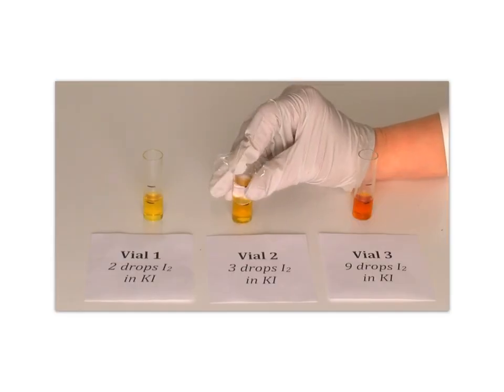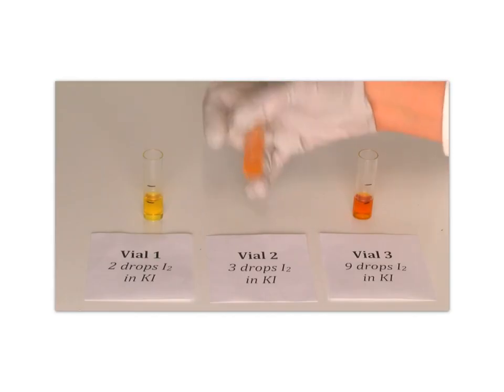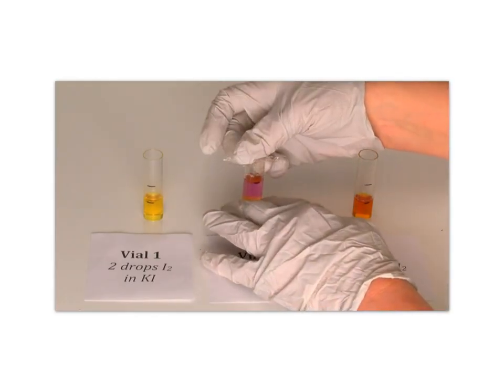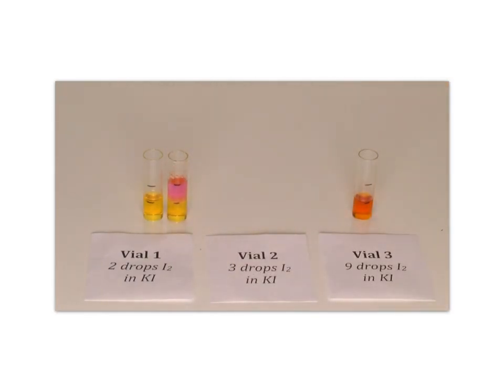Vial 2 is shaken to mix the hexane and aqueous layer. When the layers reform, the aqueous layer of Vial 2 is compared to that of Vial 1.